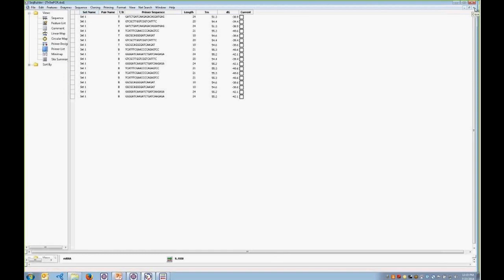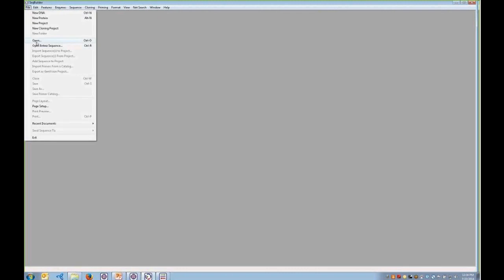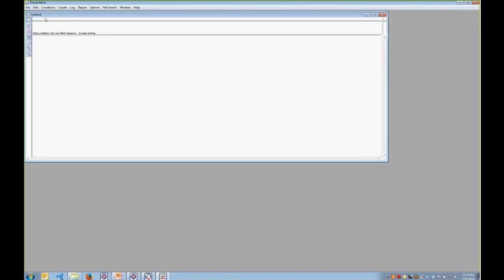We'll go ahead and close this up, and we'll move into Primer Select. Now, Primer Select is DNASTAR's application for advanced primer design. And to get started, we're just going to go ahead and enter in a sequence. Oops, the wrong application here.